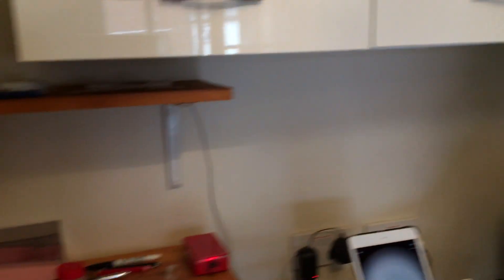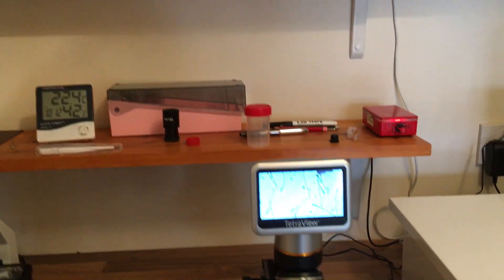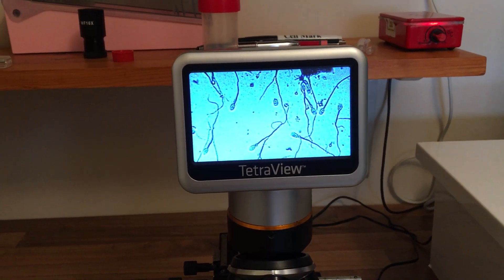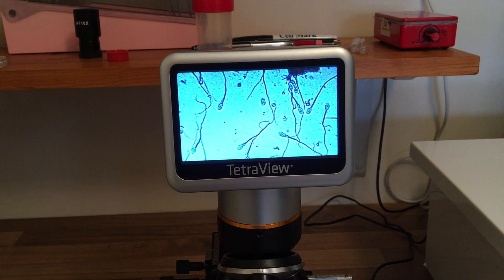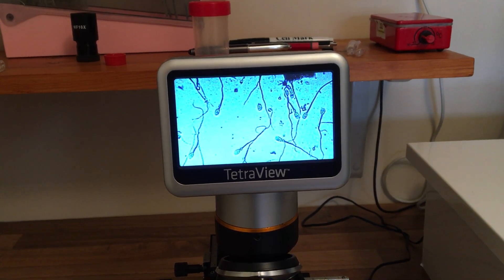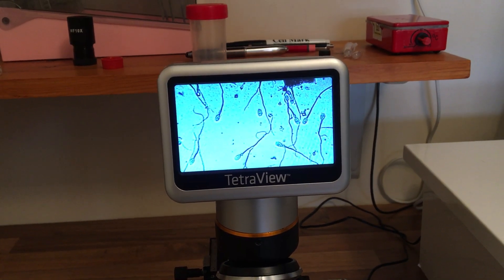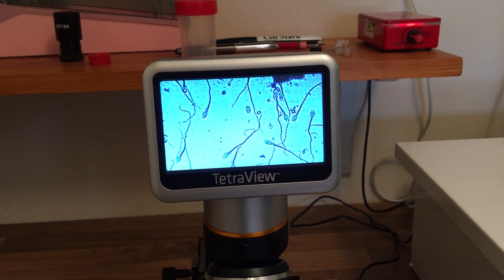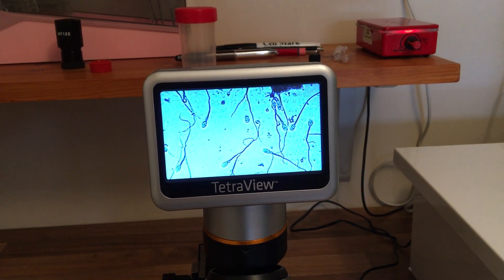If we can just have a look on the microscope - this is a slide that's been prepared. We're just checking that there are no tail deformities, that the mitochondria is a good size, and that there are no head nodules. The ideal is 70% normal morphology of a sample.